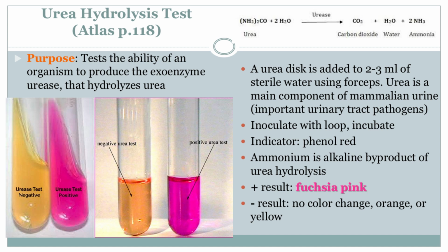Okay, I'm picturing it. We add the bacteria we want to test to this broth. Like adding ingredients to our soup. Exactly. Now, this broth contains something called phenol red. Phenol red. What's that? It's a pH indicator. It's sensitive to changes in pH. So it's like a pH litmus test. Precisely. If our bacteria are producing urease, they'll break down the urea in the broth, releasing that ammonia, and guess what? The broth changes color. You got it. It transforms from yellowish-orange to a vibrant fuchsia pink.